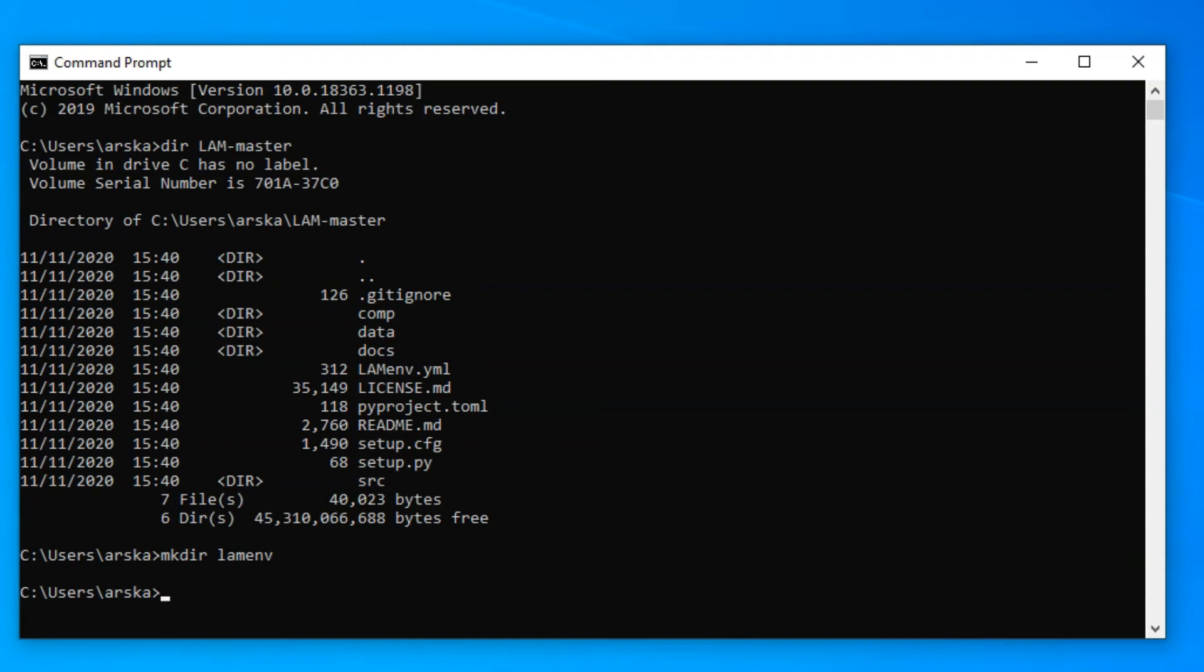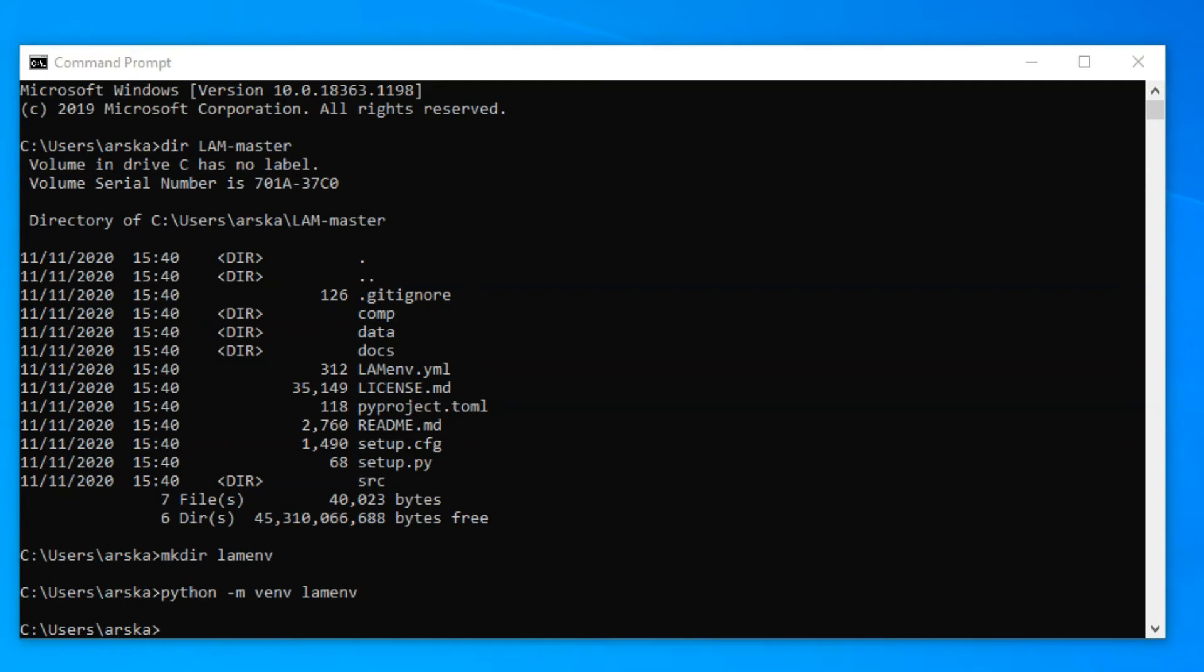If you have Python in your environment variables, this can be done by typing python -m venv and the name for the wanted environment. If you do not have Python in the variables, you need to give the full path to your Python executable in your Python installation folder.